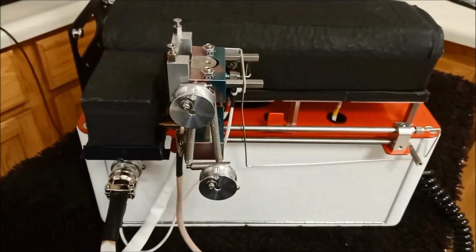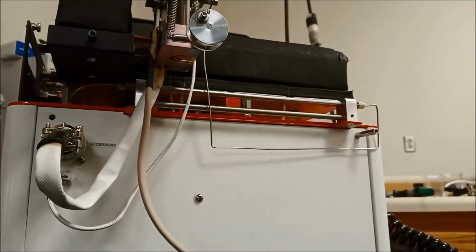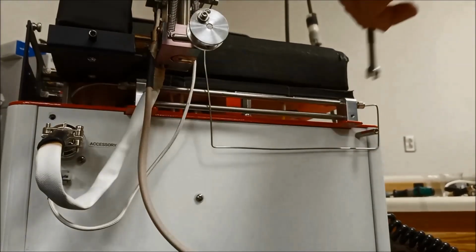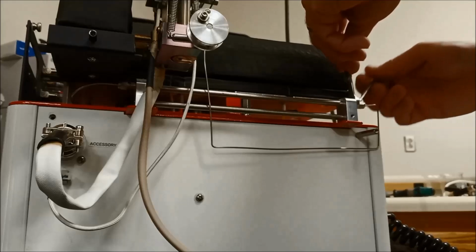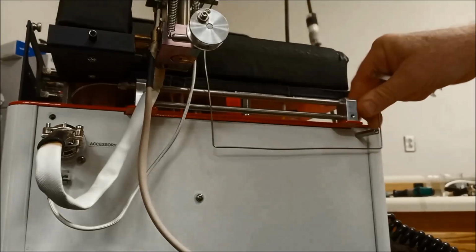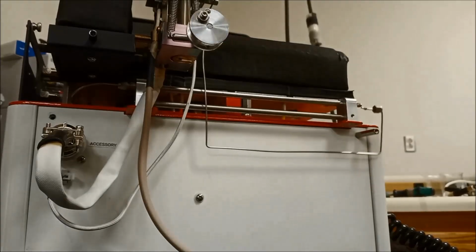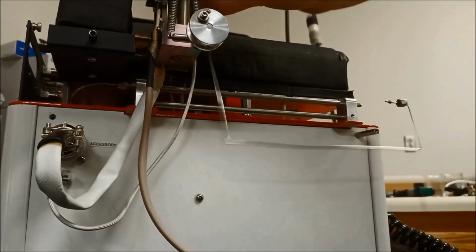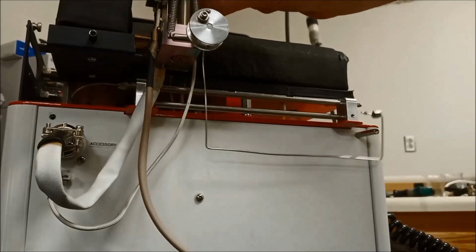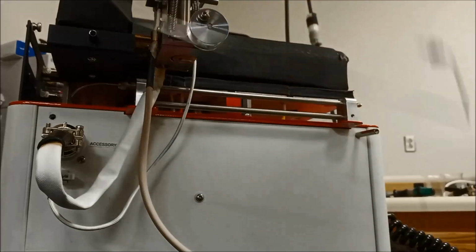Okay, we're going to remove the disc in order to install the manual pyrolyzer. Start off with two 5/16 inch wrenches. Undo that line. Disconnect from the top of the disc, to remove our carrier gas.